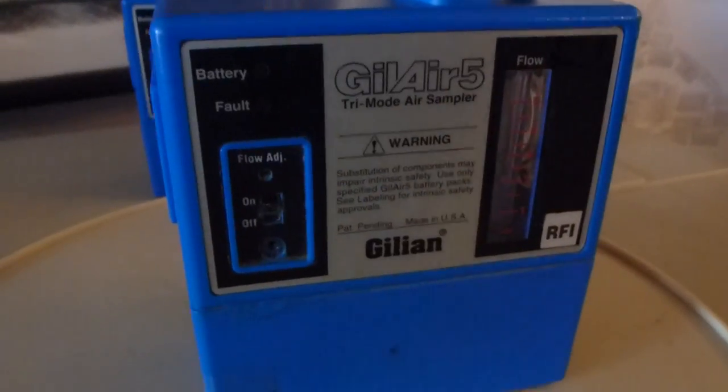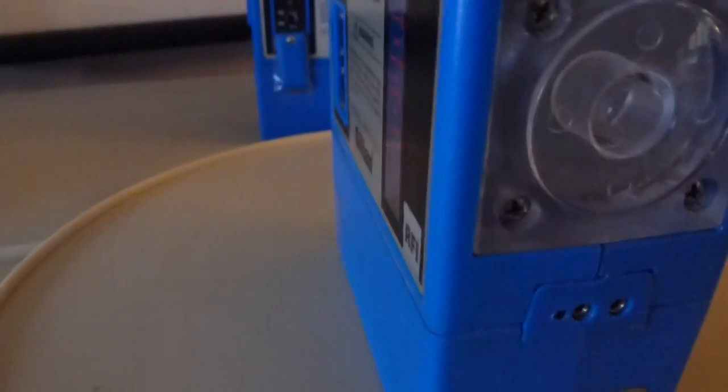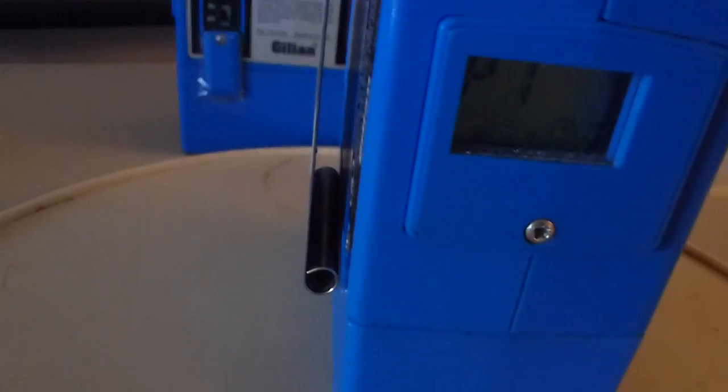The third one, also after it's turned on, the gauge appears to be working. It has a serial number, but it's very faded, and the LED also appears to be working.